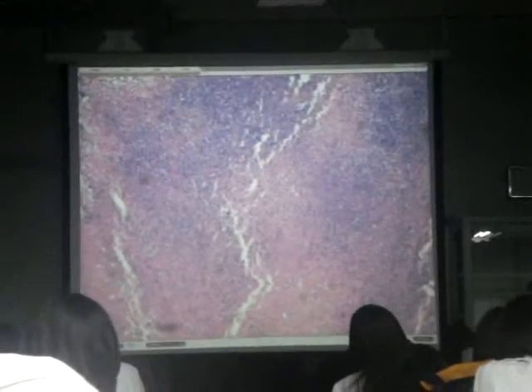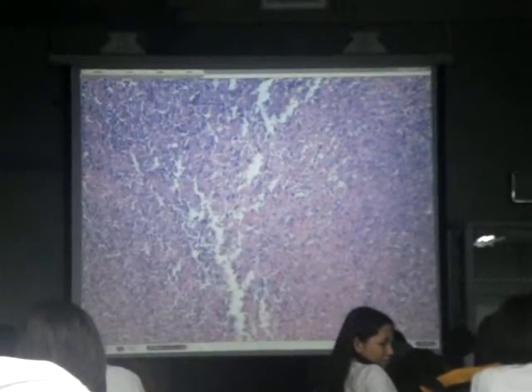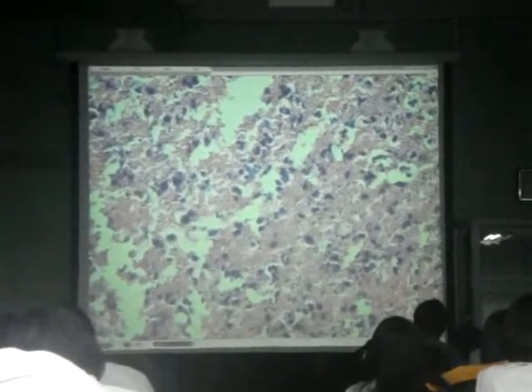Can you identify this tissue? Here. Can you identify those structures, those tissues?